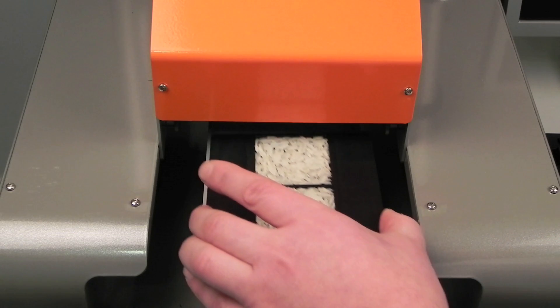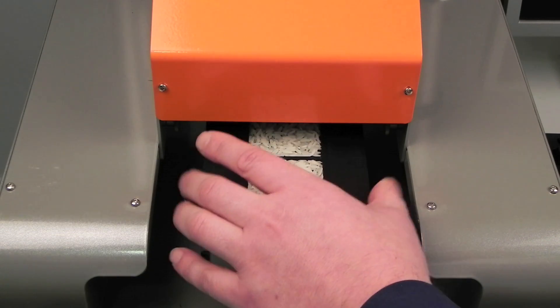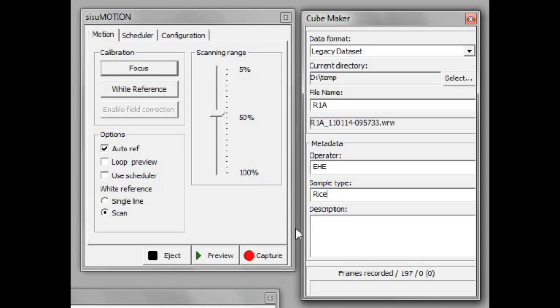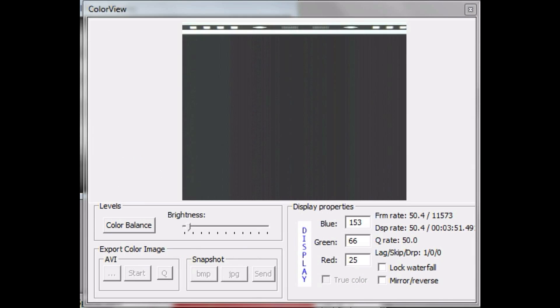The measurement process is made as easy as possible. After placing the sample on the tray, the user inputs the required metadata. To start scanning, just press capture.